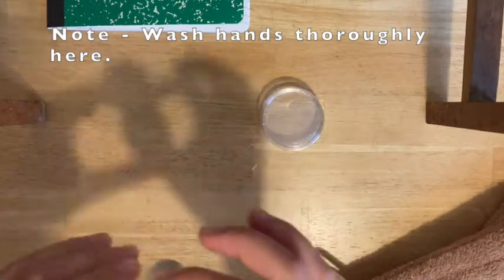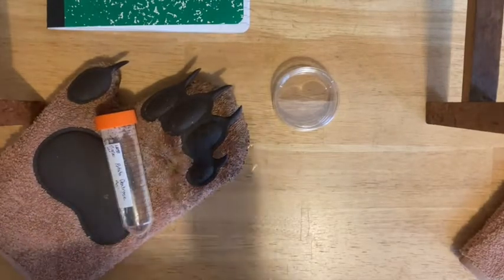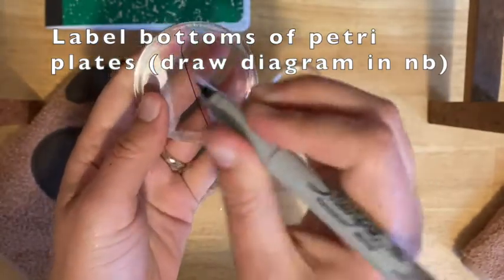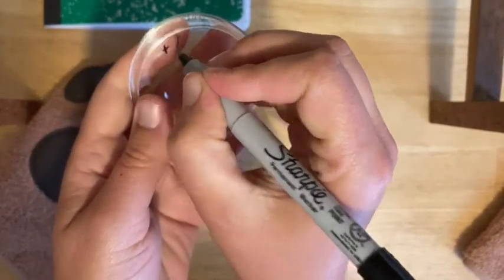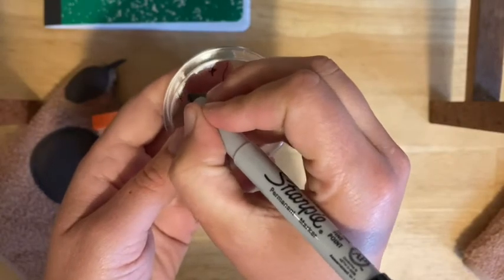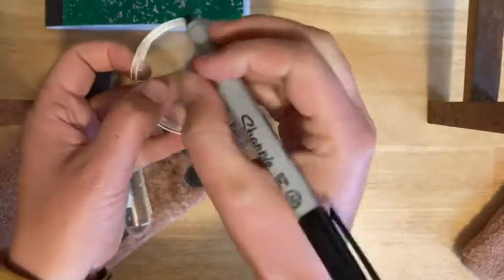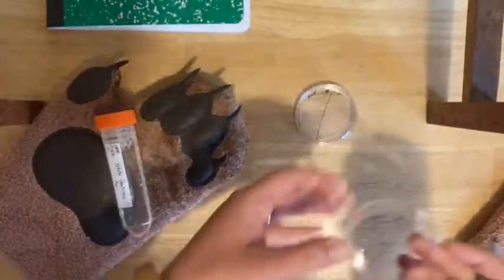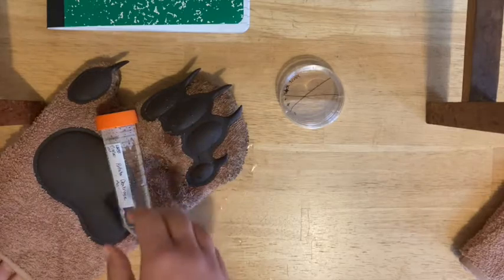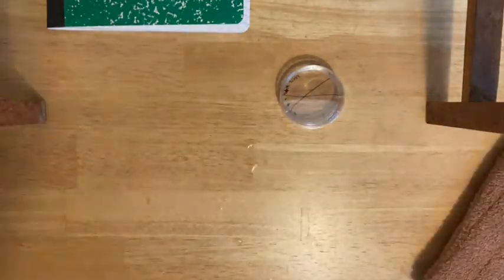Once you've mixed it, you can go ahead and pour your petri plates. Label them on the bottom. Half of the plate will be positive, meaning it has the yeast, and the other half will be negative, meaning it doesn't. Put a plus on the yeast side and a minus on the control side — no yeast. Then write what's in it, so 'yeast.' Make sure you're writing small and around the edge. Stack them up and you're going to pour starting with the bottom plate.